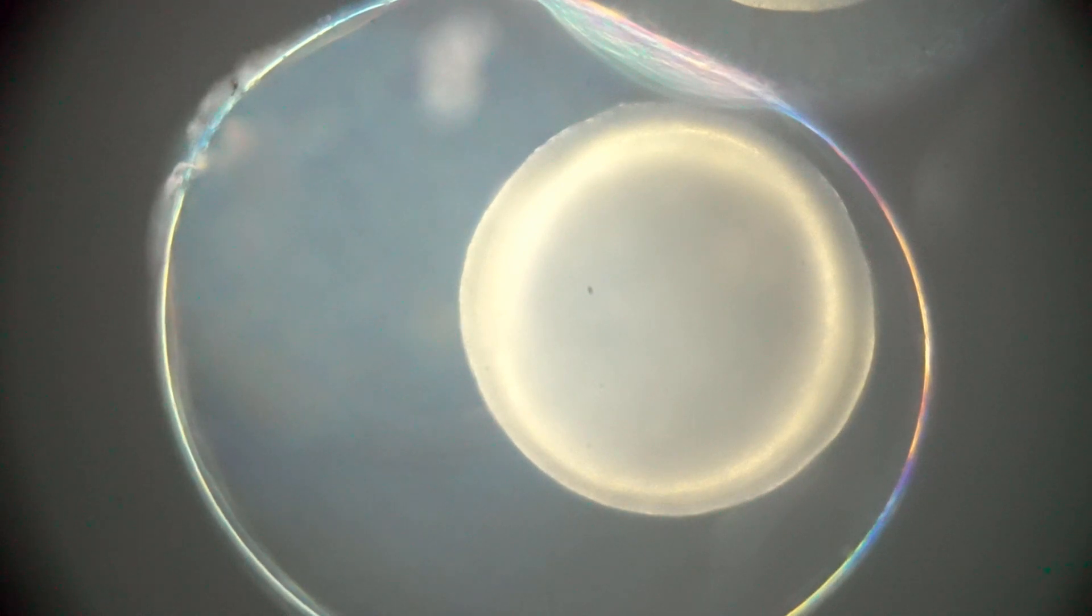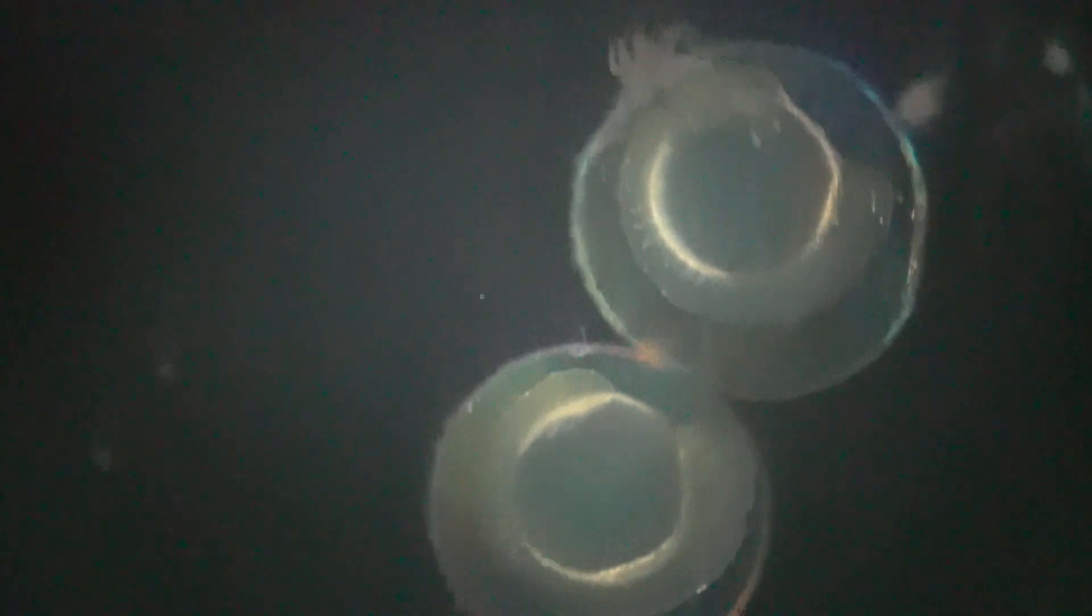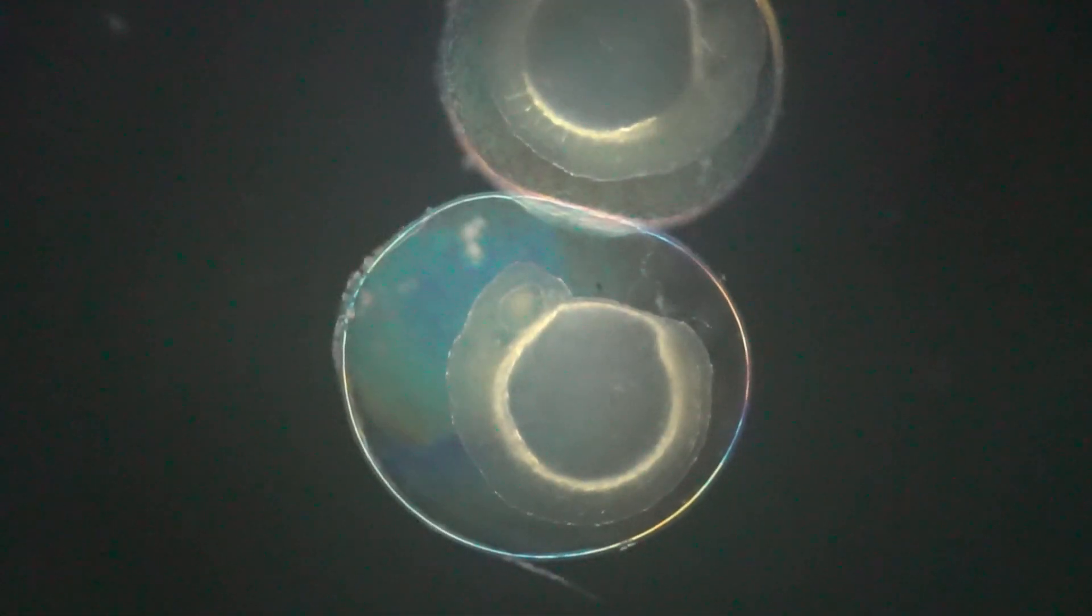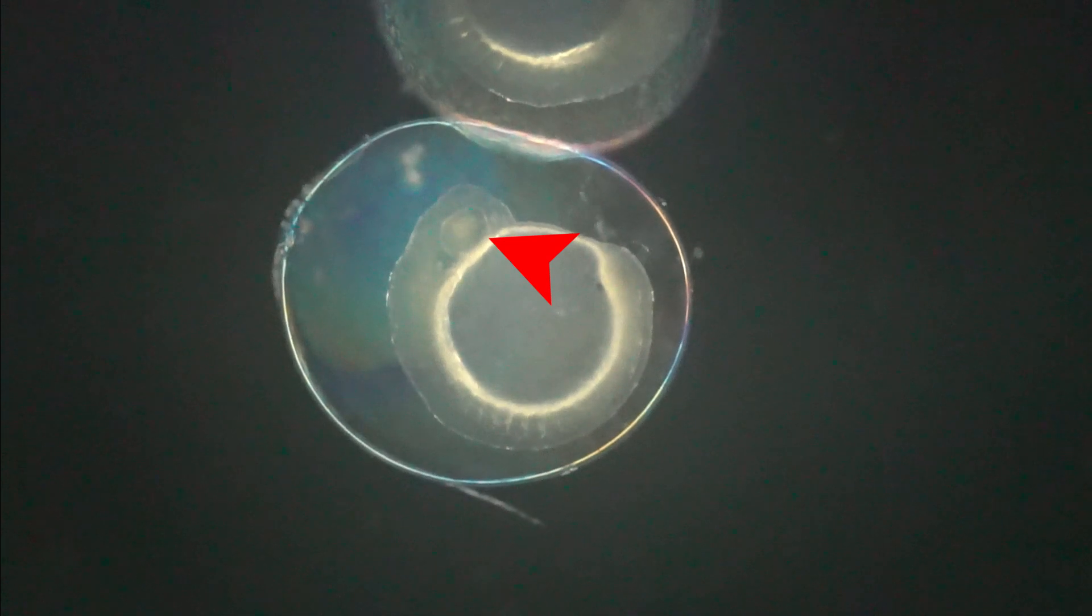So it's getting late and I had to get some rest for work the next day. So we have to skip forward to about eight hours later and you can see that a lot more development has occurred. We've gotten to the point where you can determine more of an embryo. You have the hypoplast which is the head end of the embryo and you have the epiplast which is more of the tail end of the embryo. You can see that some of the organs are starting to be developed such as the embryonic shield over the head as well as some of the neurological organs like the eyes and the ears.